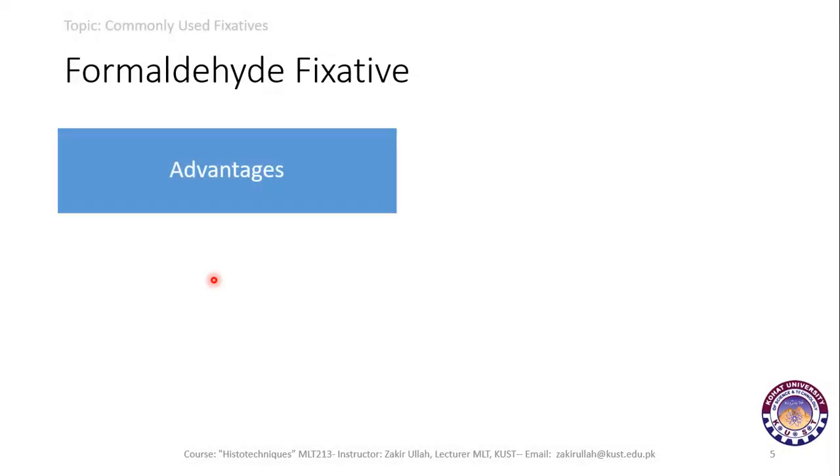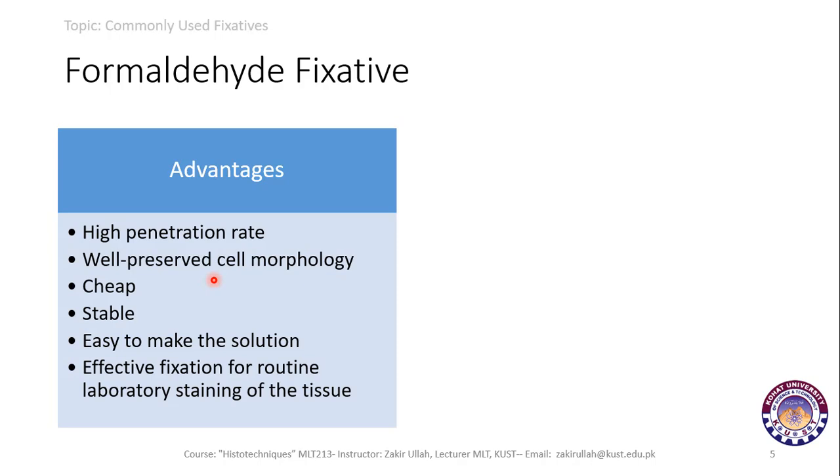The advantages of formaldehyde as a fixative: the penetration power of formaldehyde solution is very high as compared to the other fixatives.